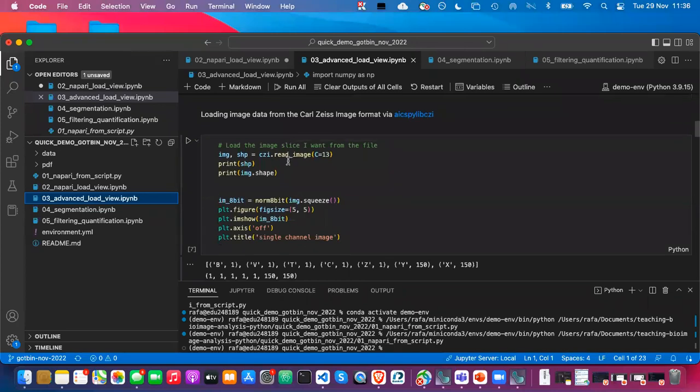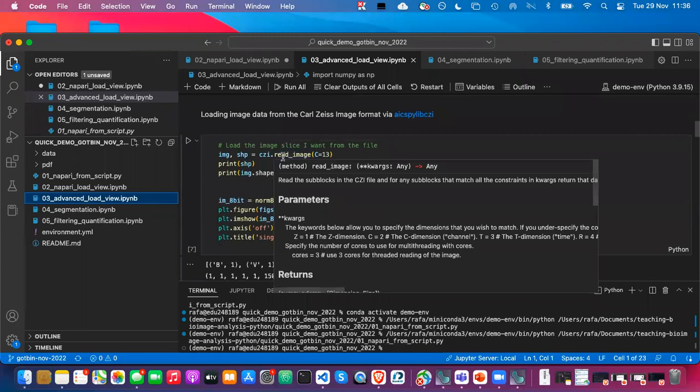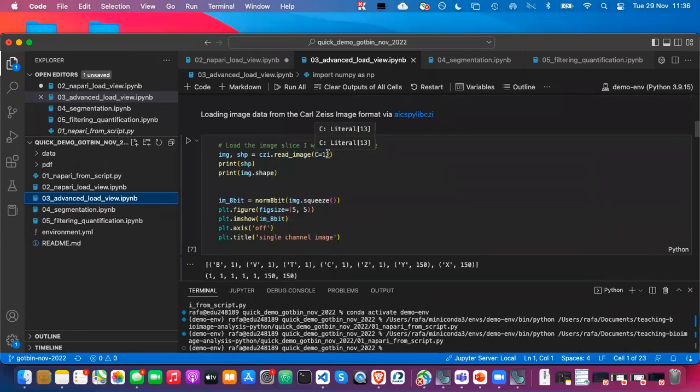Now that I have this, I can read from my image file a particular channel, a particular plane, or a particular time point. I don't have to load the whole thing, which might be too big. The data that I'm showing today is what we call multispectral data, so I have 32 color channels. If I load them all at the same time, it becomes very difficult to follow what's going on there, okay?